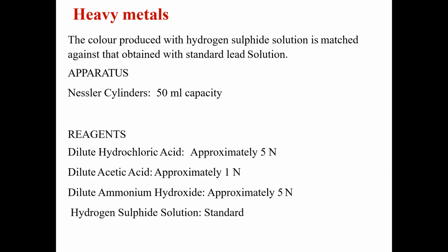So, the heavy metals. The color produced in the case of heavy metals with hydrogen sulfide solution is matched against that obtained with the standard lead solution.